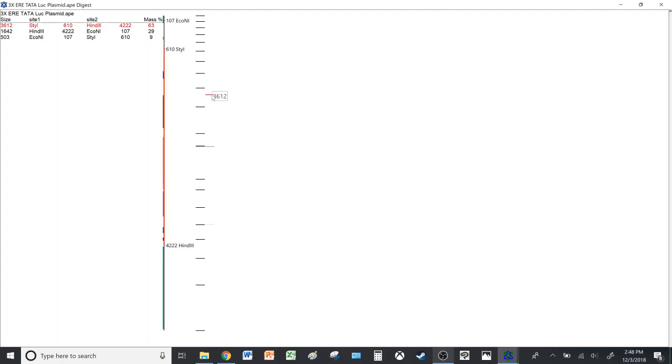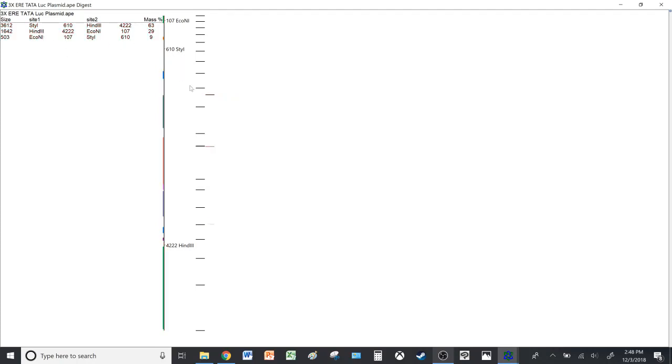On the left you see the black turns red, which indicates the highlighted portion. It might be a bit difficult for you to hover with your cursor on the thin bands, so you can easily do that on the left side here and it will pop up on the right side.